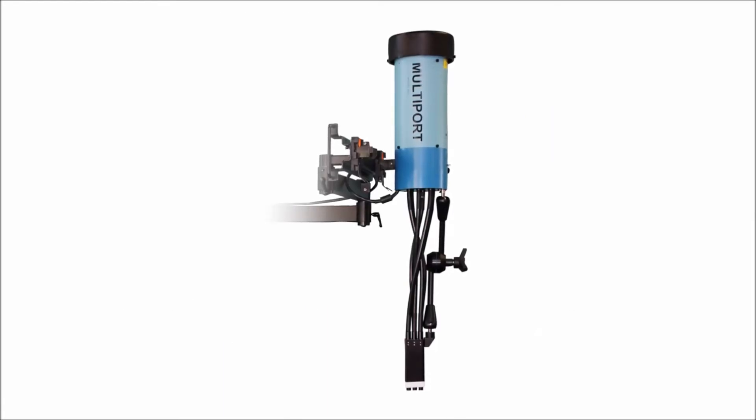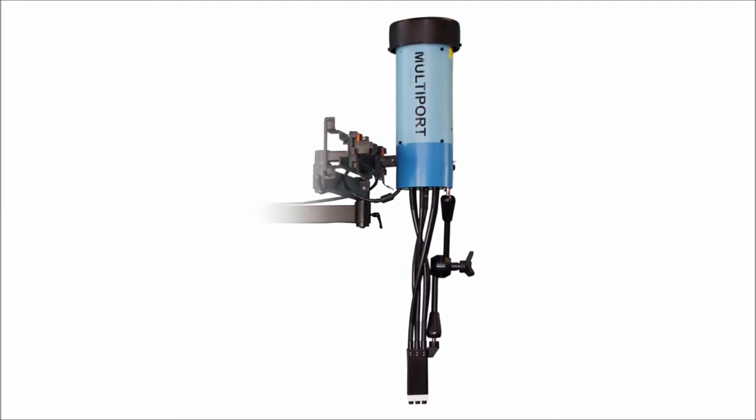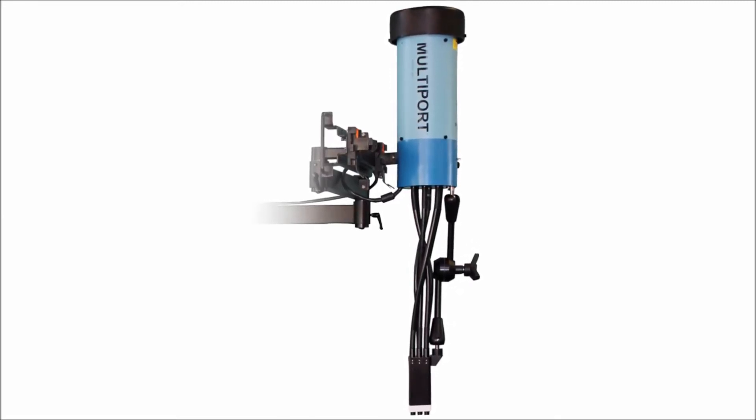Solar Light's Advanced Model 601 Multiport SPF Testing Solar Simulator is the industry standard for high-throughput SPF testing and dermatological studies.